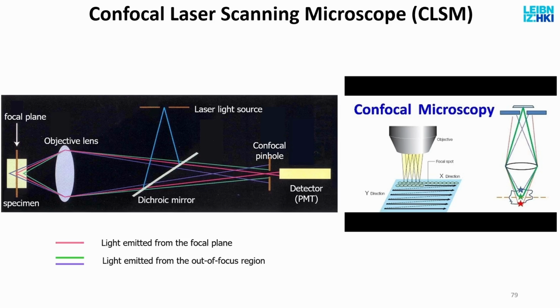So this is laser scanning confocal microscopy. Basically, you move the laser in the XY direction, very quickly in X and more slowly in Y, until you have this pattern that scans the entire surface. Then you change the focal plane, scan it again, change the focal plane.